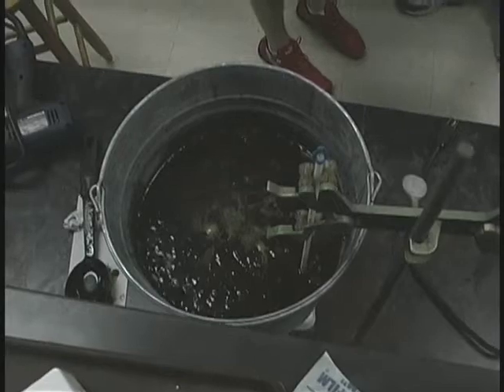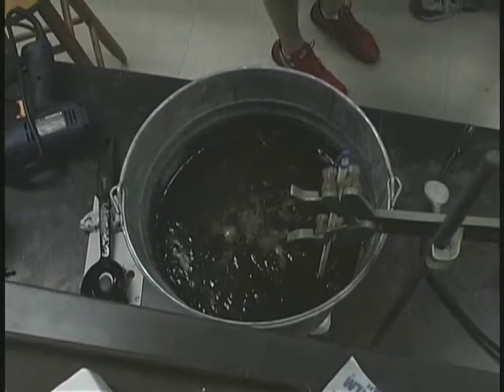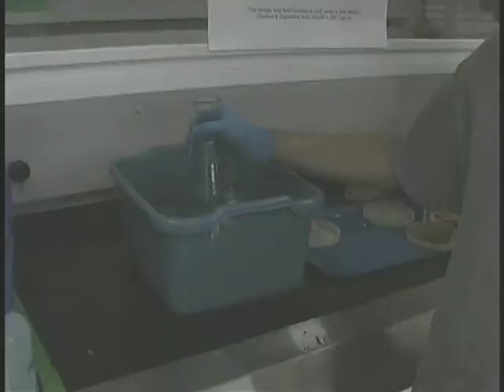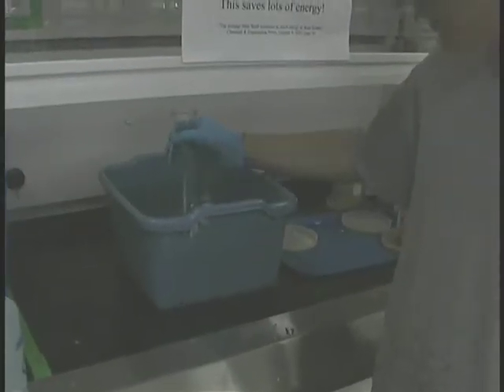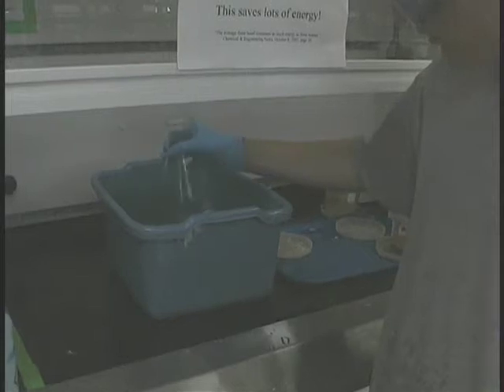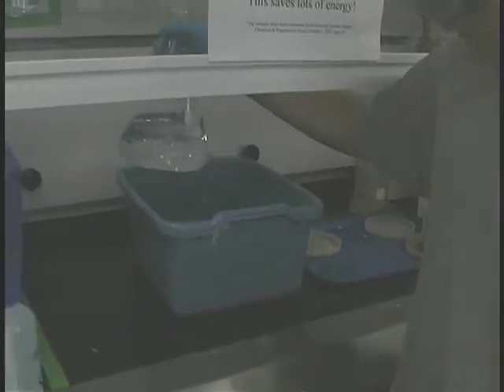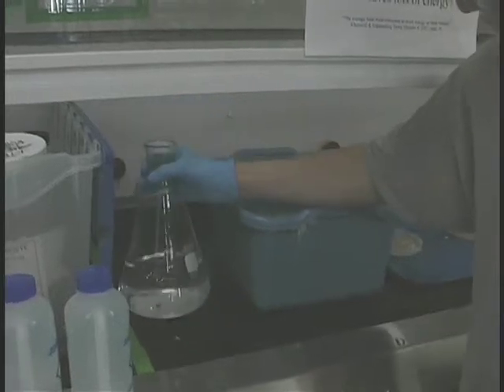Meanwhile, while the glycerin byproduct and oils are melting and dissolving, the students were able to prepare the sodium hydroxide solution, which is used for the saponification. We used sodium hydroxide that was available at a local hardware store, which was then dissolved in water.